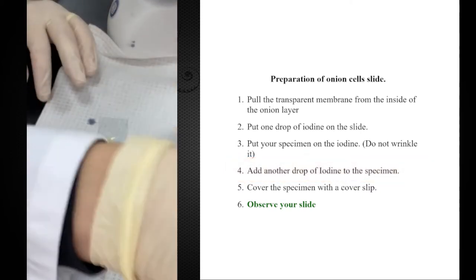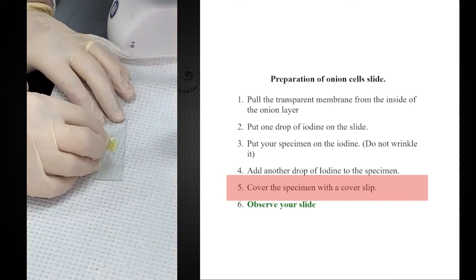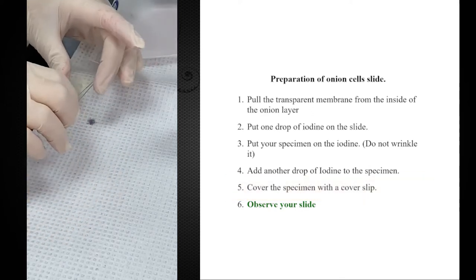Where did I put my cover slip? Okay. Then I take a cover slip, touch the liquid, and lower it slowly on the skin of onion to avoid catching air bubbles. There is no excess liquid.